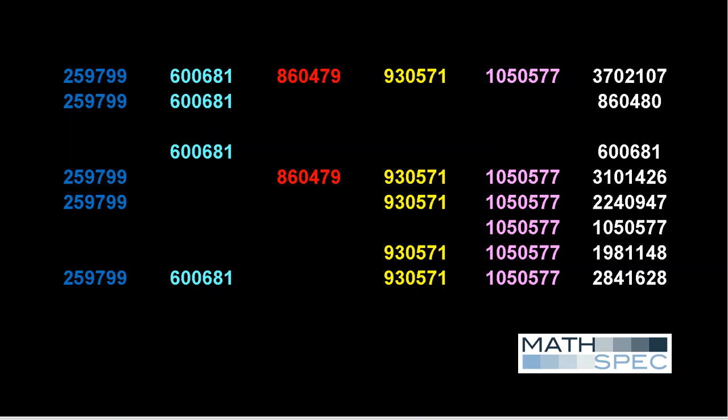The triplet mass at 224 together with the 198 pair implies that the 26 subfragment is connected to either the 93 or the 105 subfragment, but it cannot be a connection in between these two subfragments. And we can also deduce that the cyan subfragment and the red subfragment are outside masses because they can be lost without affecting the rest of the structure. The assignments of the 60 and 105 fragments as individual fragments do not really help as far as discrimination.